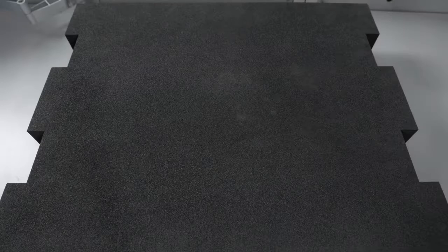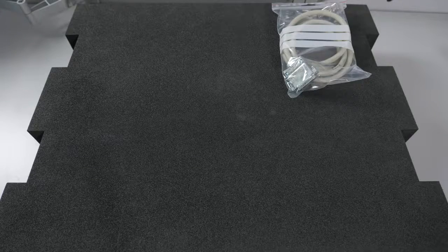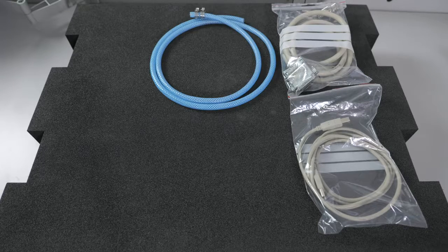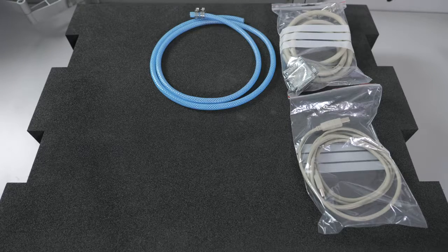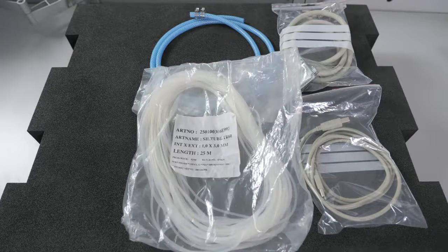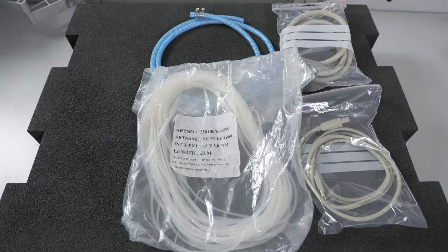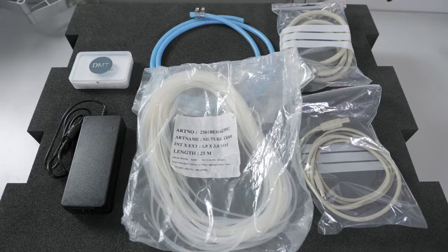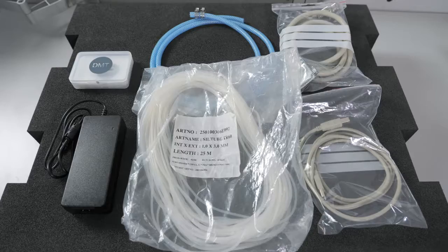Regarding the accessories that come with the system, you have a myograph cable, a USB cable, tubing and clamps that will allow you to connect your gas tank, a bag of silicon tubing to connect between the interface and the chamber, a power supply, and a USB stick containing the user manual and user guide.